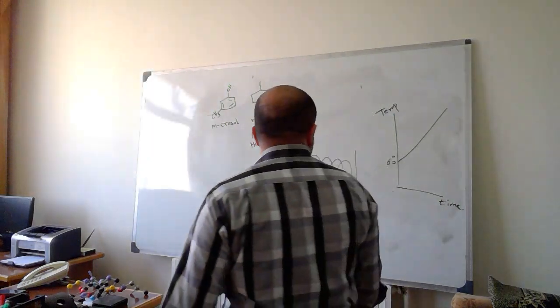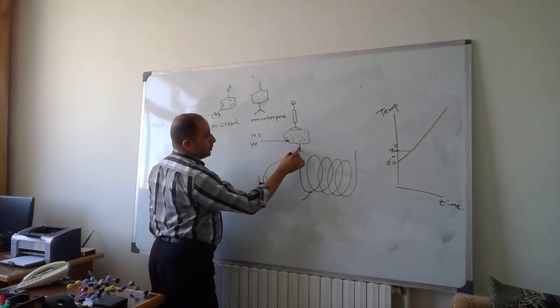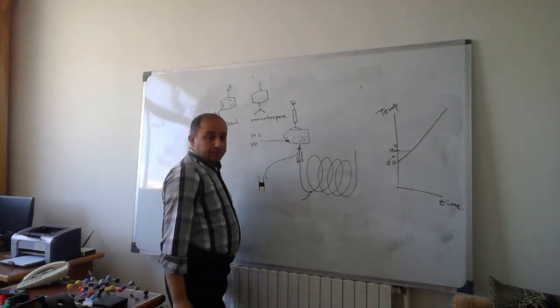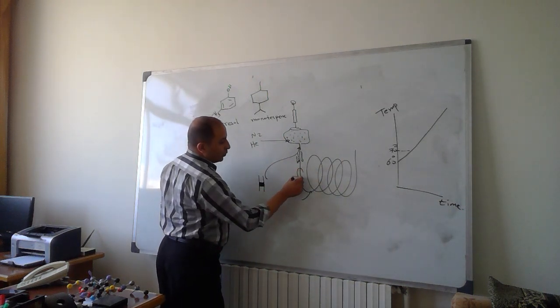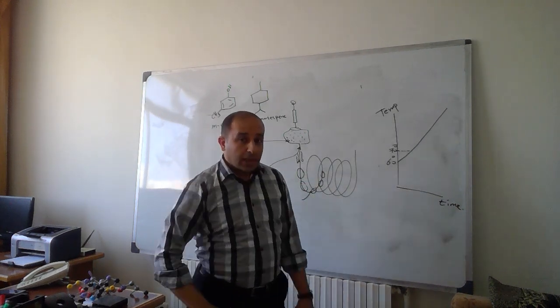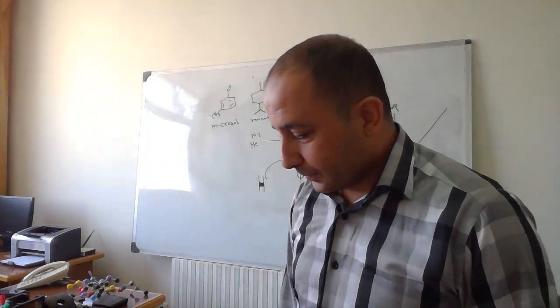So once we raise the temperature to, for example, 70, monoterpene will be converted again to the vapor phase, but metacresol is still in liquid state. So the cloud of monoterpene will go through the column, and apparently it will leave metacresol behind it in liquid state.